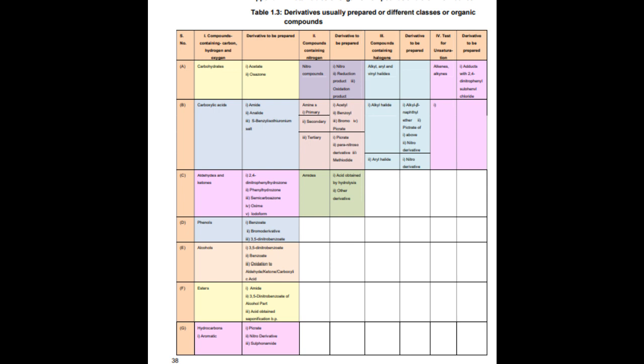A white precipitate readily soluble in ammonium hydroxide indicates the presence of chlorine. In case a yellow precipitate insoluble in ammonia solution is formed, the presence of iodine is indicated. See note below. NaX + AgNO3 gives AgX + NaNO3. Note 1. If the given compound does not contain N or S as extra elements, the extract need not be boiled with nitric acid.